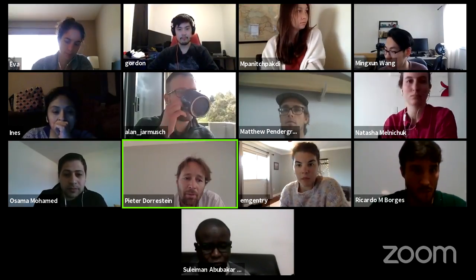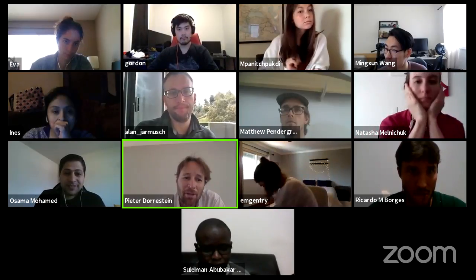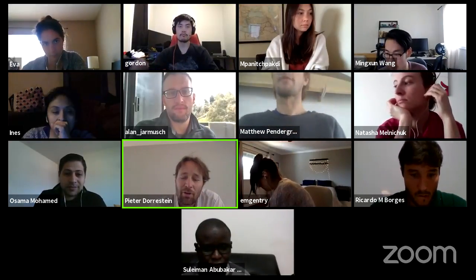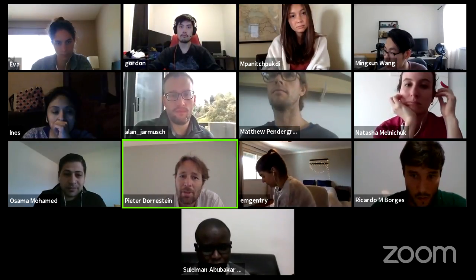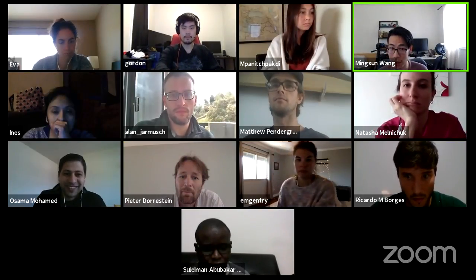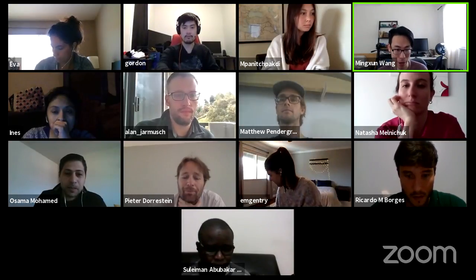Yeah, we've been communicating directly with people who do programming in MZmine. In fact, I'm recruiting a postdoc that will start in August who is an MZmine developer. We actually have several projects directly being developed together with the MZmine developers. So they are involved, but they're not answering the forum yet. So if there are specific questions you have on that, I don't know, does anybody know if there's an MZmine forum? There's a GitHub repository where you can ask about issues. Okay. As a bare minimum.